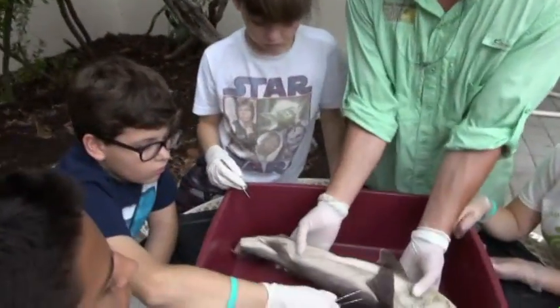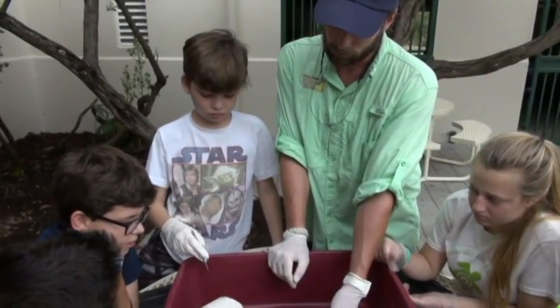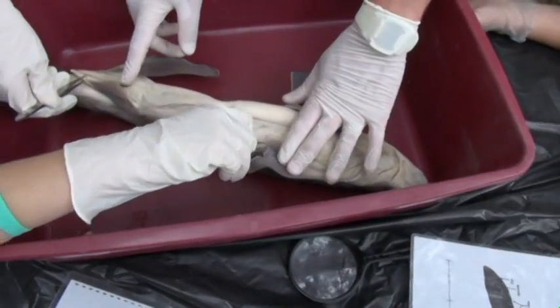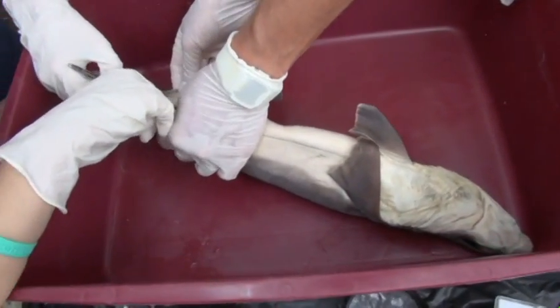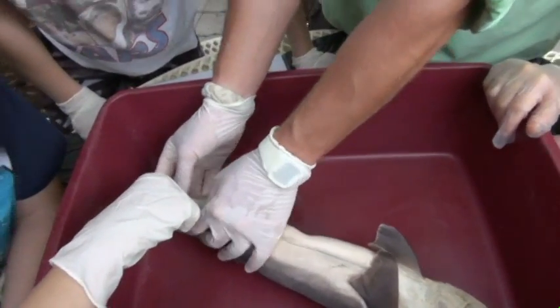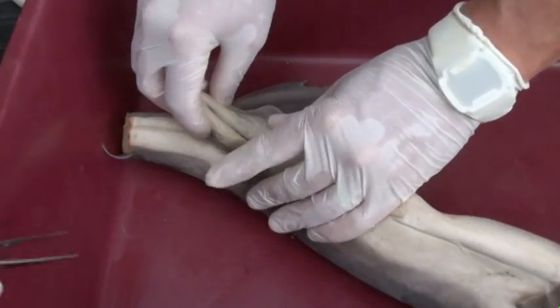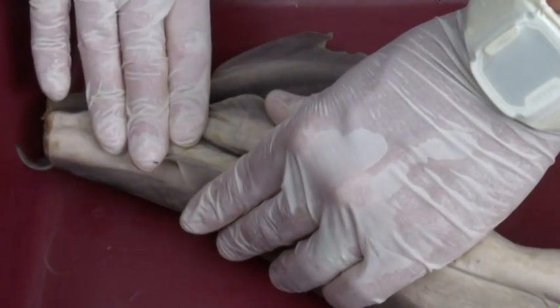Another thing I want you guys to check, we should name our shark. Male or female, does anyone know? Male. How do you know? You have to check the pelvic area. So these are pectoral fins, right? But we want to check the pelvic fins back here. There's a way to tell. On the females, you'll have your pelvic fins right here, and there'll be nothing here. On the males, you'll have these big things called claspers. Claspers are used for reproduction. When they want to mate with a female, they're going to need these, all right? So if it's got these big claspers here, you're going to have a male, and if it doesn't have any of those, you just have a female.